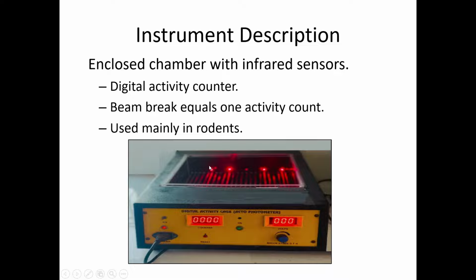If we have kept animals in this area and increase the voltage, and after animal movement it is counting, then we can easily conclude that at the given voltage the instrument is showing counting, which means you can easily use this for the calibration.